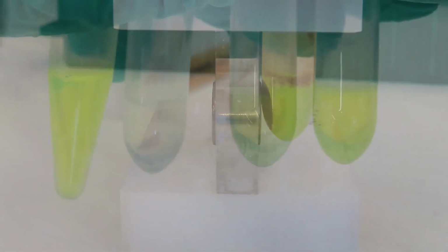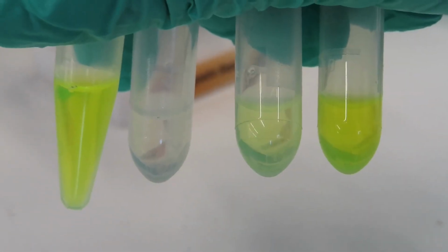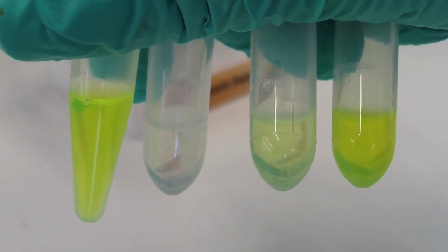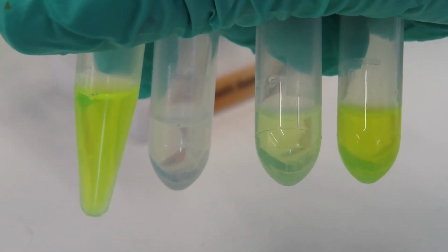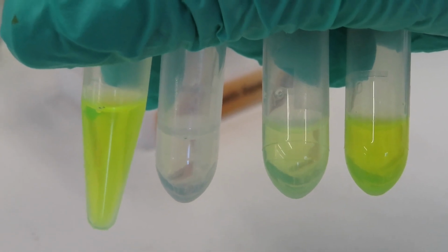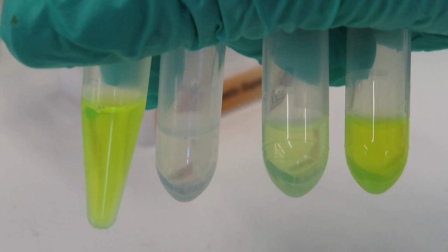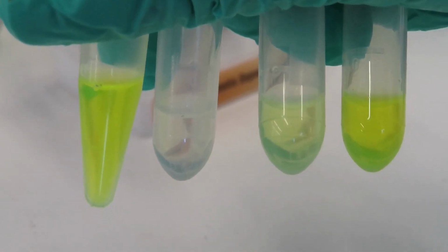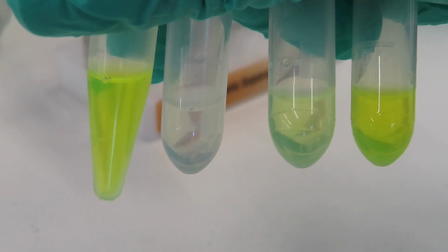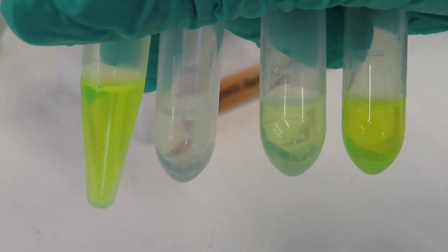Here we can compare the color of the samples obtained in each step. From left to right, it can be seen a high GFP concentration in the initial sample. The flow-through in the second tube, with unspecific proteins, shows an almost absent GFP. The third tube shows some amount of unbound GFP produced during the washing. And finally, the last tube, with the eluted sample, has high amounts of the green protein.